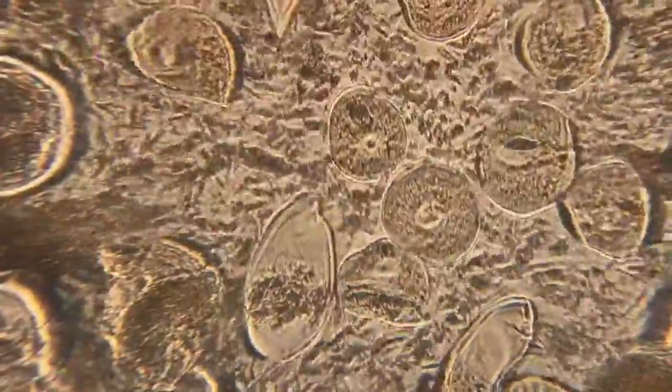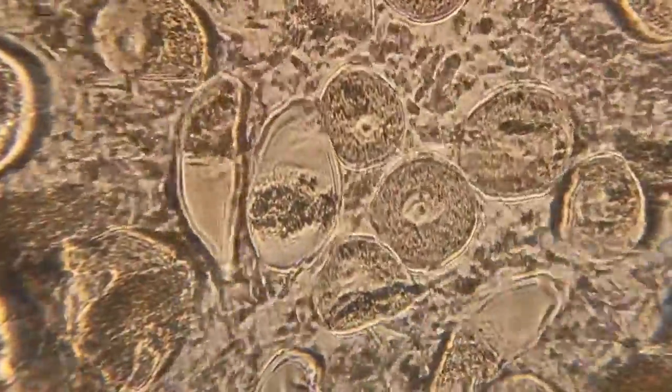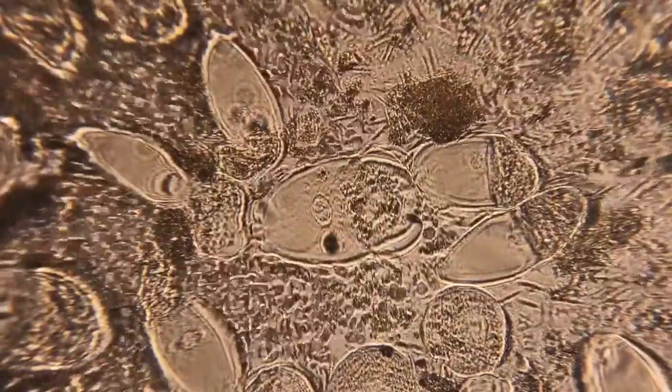You can use liquid samples by putting a drop of liquid between two cover glasses with a little bit of wax to hold it apart. This sample shows the protists that live inside the gut of a termite.